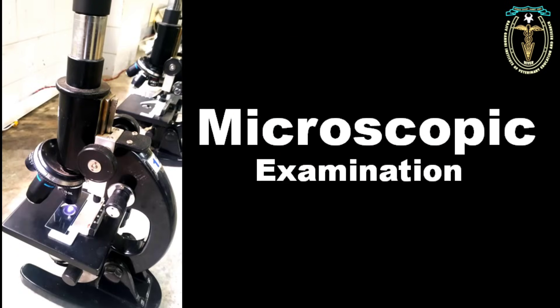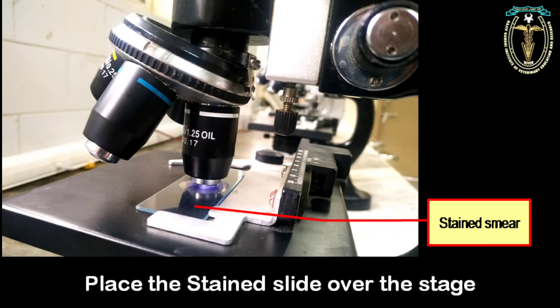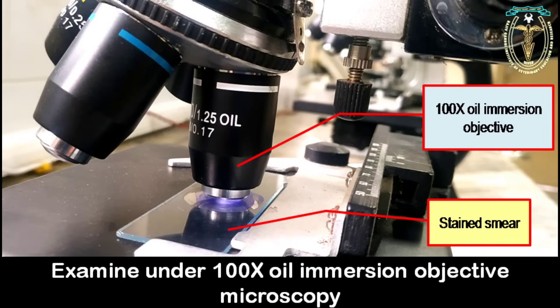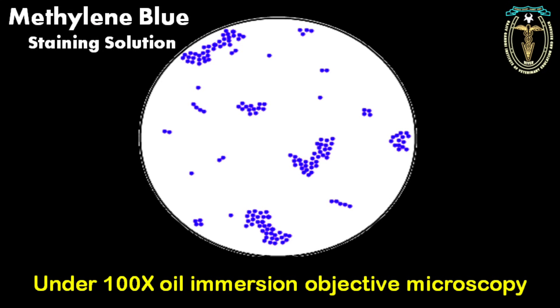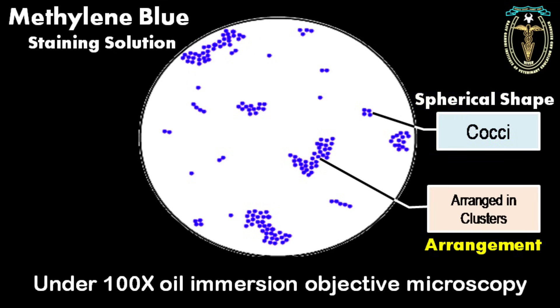The microscopic examination: place the stained slide over the stage and examine the slide under 100x oil immersion objective microscopy. On microscopic examination, since we have used methylene blue staining solution, the microorganism stains blue. Here the organisms are spherical shaped, so they are cocci, arranged in clusters.